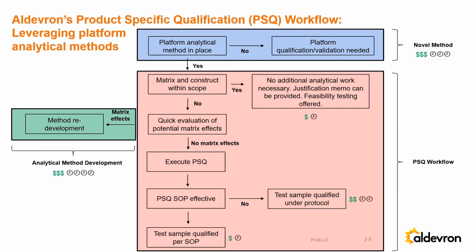So again, the idea with these platform methods, right, is we have to have them, we have to be robust, and then we leverage the PSQ process to keep our clients moving forward in their process and bring new methods, new products into scope of the method.